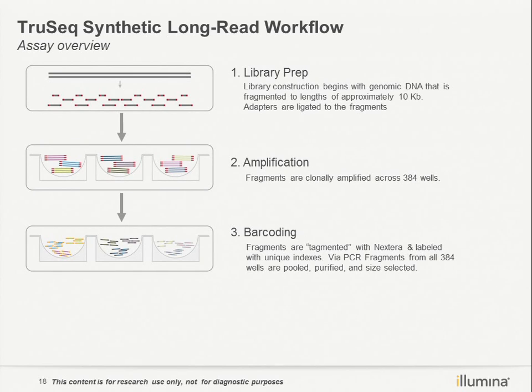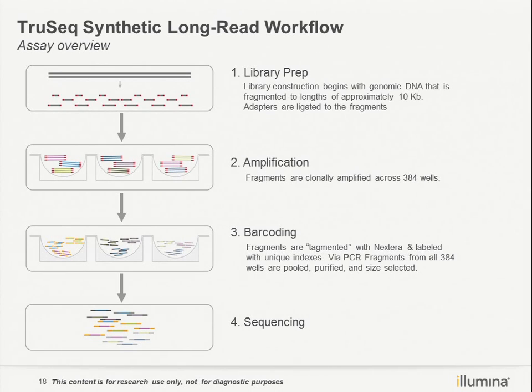For all the reads from each individual well, we already add the adapters with some indices to identify which individual well each small sequence comes from. Then finally, we mix all of the small sequences together into our library and do the sequencing.